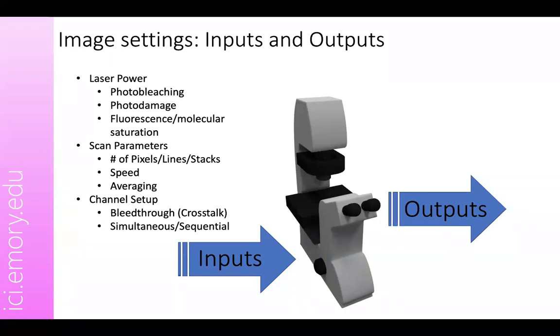We will talk about some of the ways you can filter out this background noise. For example, you can use a median filter to remove some of the noise. But image analysis should not be the solution to remove the noise. The noise should be removed when you are taking the image. So try to make your life easy when you take your images versus trying to use a bunch of filters to remove the noise.